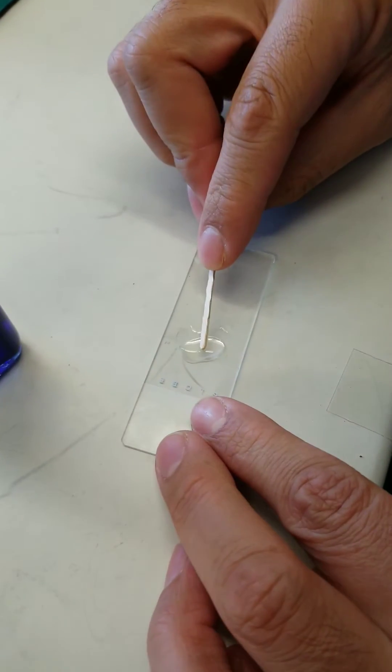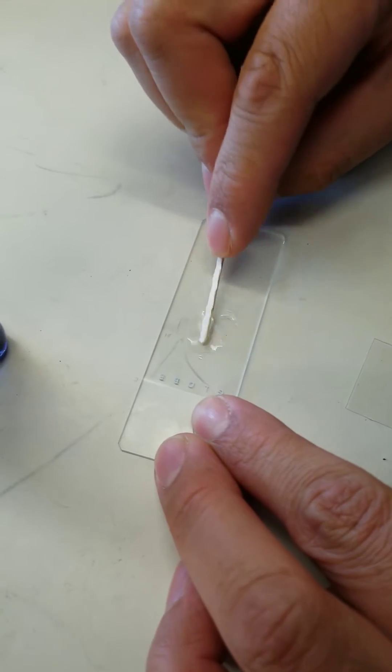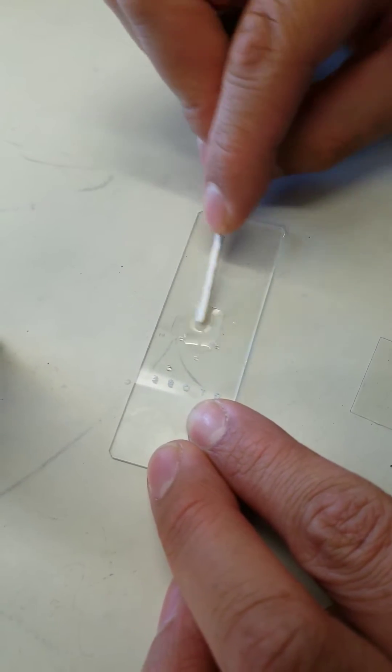I'm going to take a toothpick and gently scrape — not too hard because I don't want to hurt myself — gently scrape the inside of my cheek. Now that I've done that, I already have a drop of water on here. Saline would probably be better. And I'm going to mix that into the water, get all those cells out into the water.